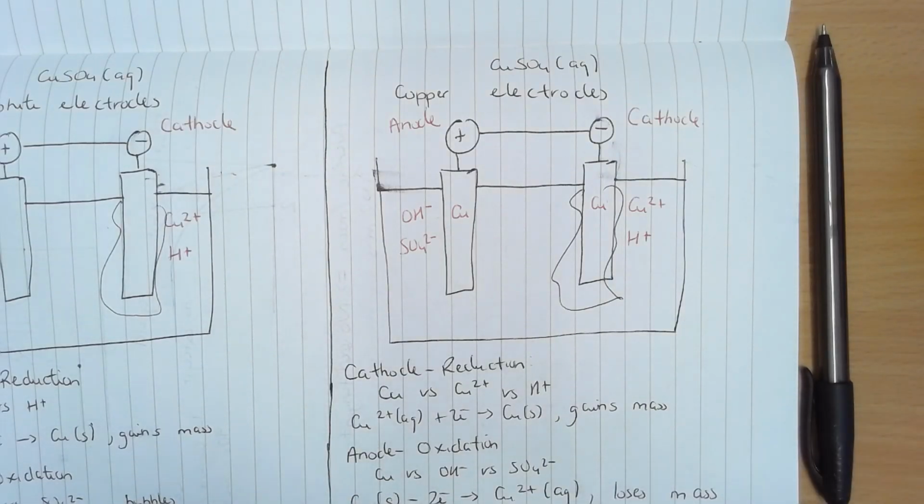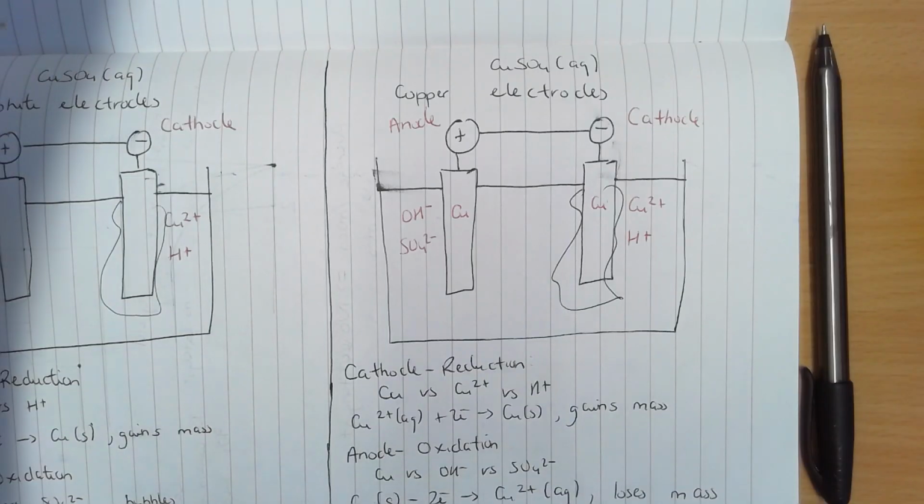Your other option is to use propanone, which is a solvent. It will rinse it, and the advantage of propanone is because it's got a really low boiling point, it will evaporate quickly, so it makes it easier to dry. You wouldn't even need to pat it dry, it will just evaporate. Right, have a go at doing questions 6 to 10, please.